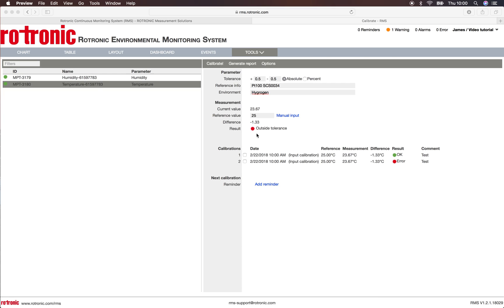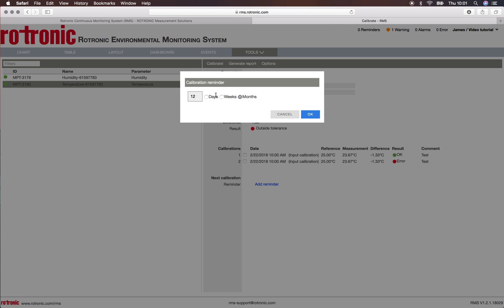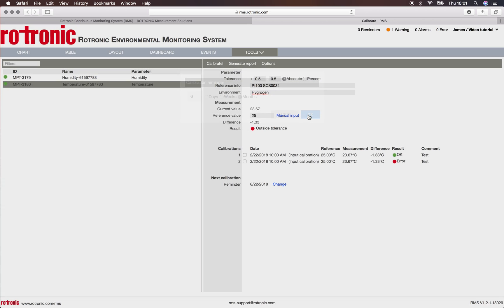I'll close this report. Now let's say the probe is calibrated and everything went to plan. We simply then add a reminder. This reminder we would like to have in six months time. So we put in six, we put in months, we click on OK, and that will add a reminder to the system for the 22nd of August 2018.